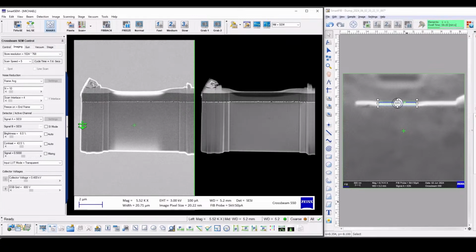All right, we're seeing the bottom get quite a bit thinner. You're seeing through it pretty good. And we're seeing that really bright area at the top of the secondary electron and the InLens image that's correlated with the corresponding dark area. It's expanding kind of towards the top, that little thin strip that goes from left to right, the layer.